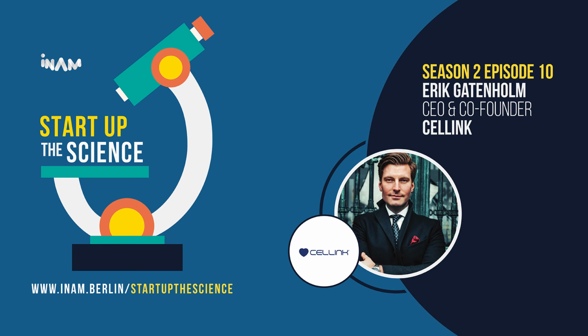So you first developed the Bioink, and then you realized that more could be done if there were more affordable bioprinters out there that everyone could have access to. And you then went on to develop the bioprinters. Do these work just with your ink, or do they work with other materials as well?